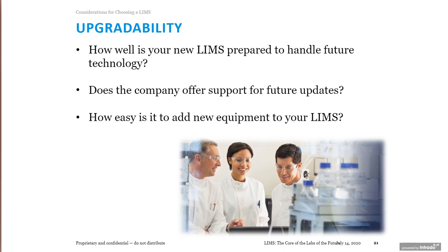Upgradability. How well is the new LIMS prepared to handle the future of technology? As I mentioned before, nowadays, every several months, we have changes in operating systems, database technologies, hot fixes. Can my system allow me the upgradability I need to cope with those technological changes? Does this company offer support for future updates? And how easily can I add new equipment to these LIMS systems without having to customize?